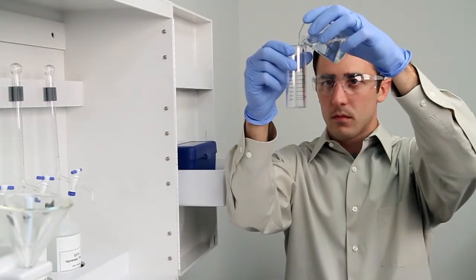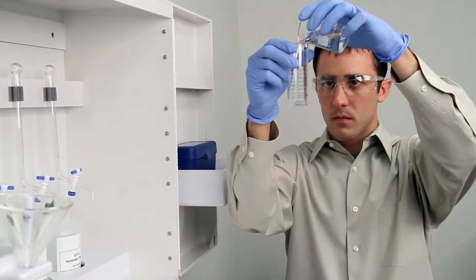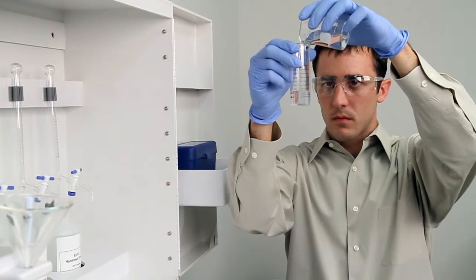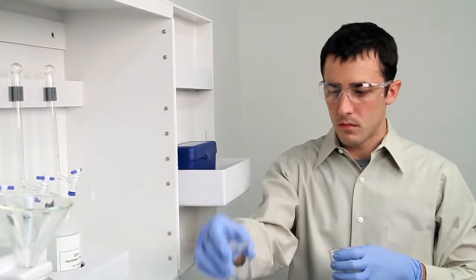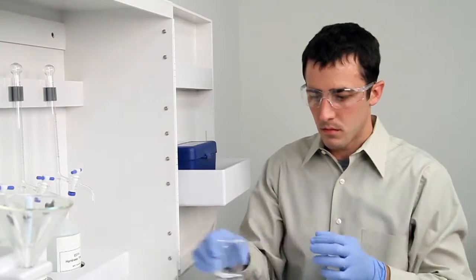Then place the vial on a level surface and bend down to eye level to verify that you have collected an accurate sample. The slightest change in sample size will lead to inaccurate results.